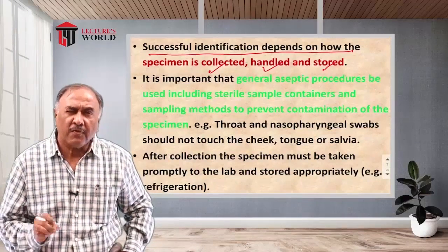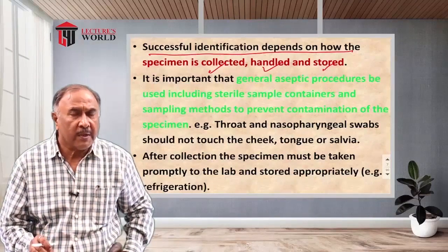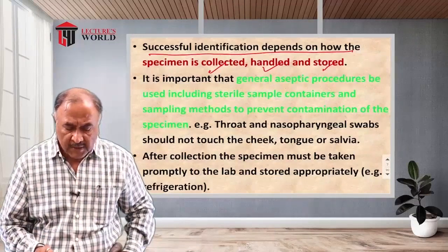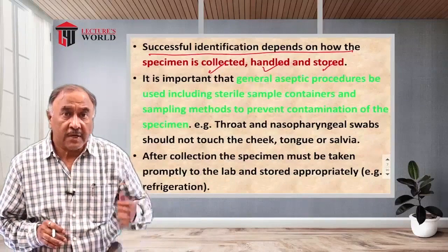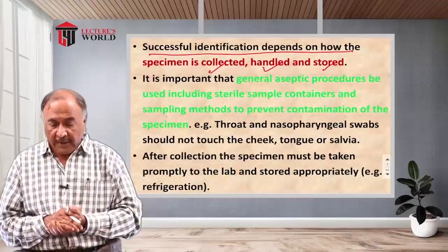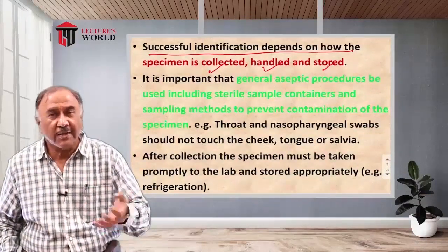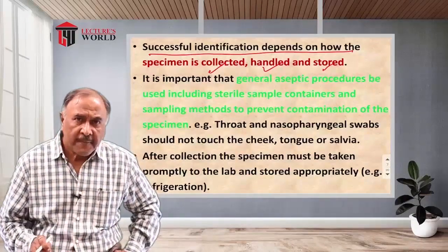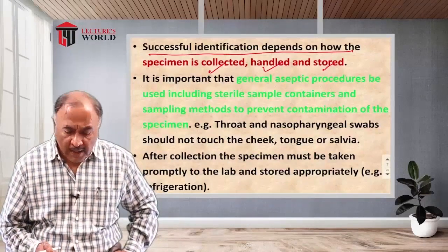This is one of the very accurate diagnostic methods for identifying mycobacteria and diagnosing TB. So sputum is collected overnight, that is, first morning sputum is collected. It is treated with NaOH and then KOH and then centrifuged. The sediment is prepared for a slide and then stained by the acid-fast technique.